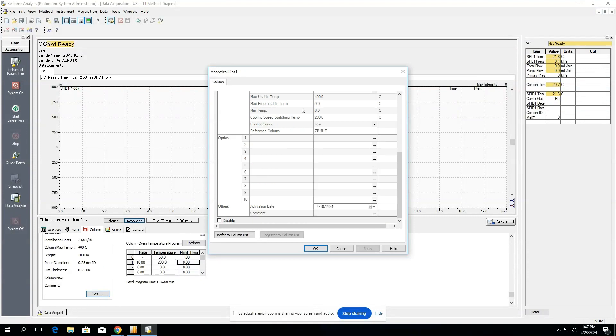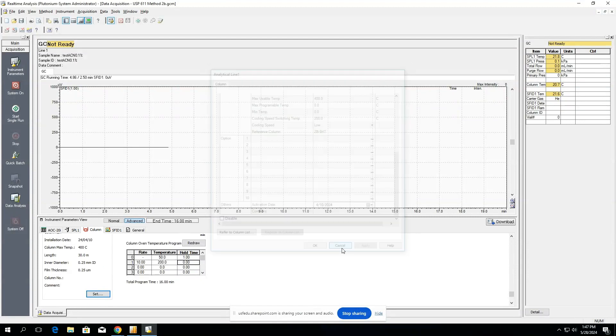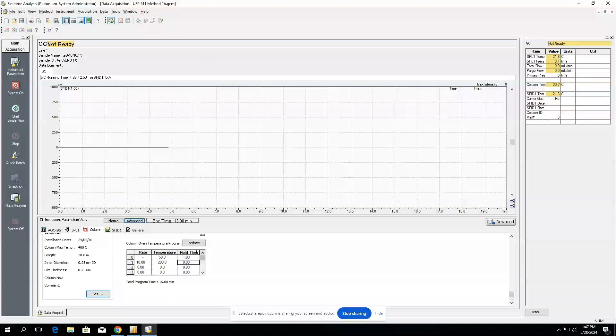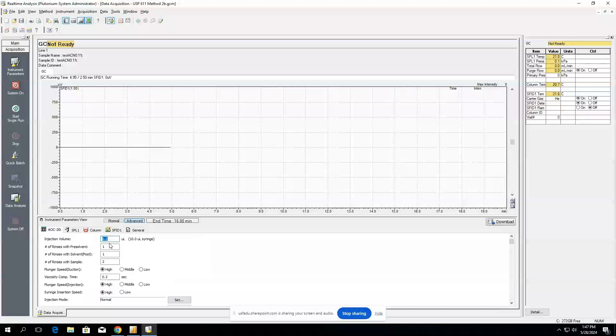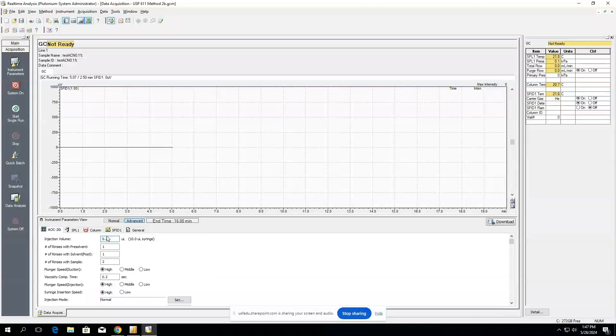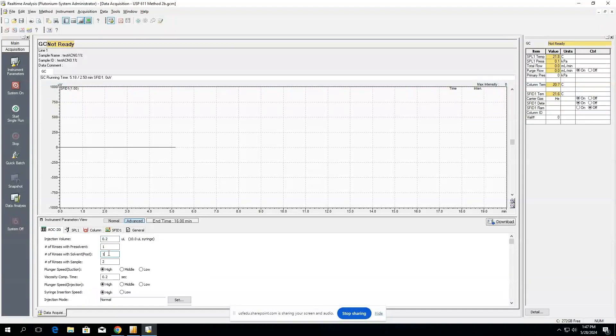When that's all done, you can hit OK to save, and then from there we want to make sure that we actually set up our auto sampler. Again, depending on your method, you might have more or less of an injection volume. Let's say our method calls for 0.2 microliter, and then here the following parameters are how we'd like to handle the auto sampler before and after injecting sample.